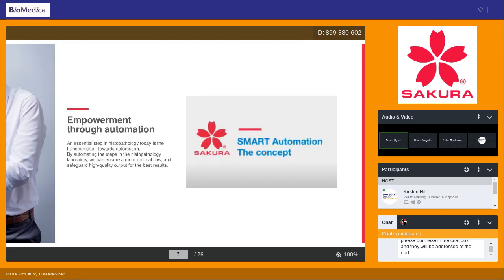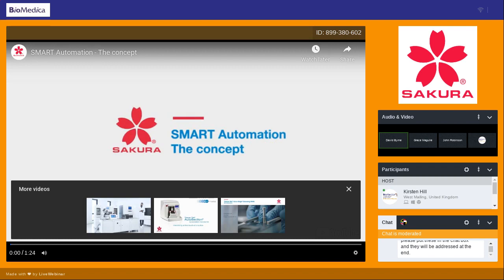So I'd just like to show you a very short animation. Again, this just provides some background as to the whole concept of what we're doing. I'd like to show you a small video that explains what the SMART concept is.